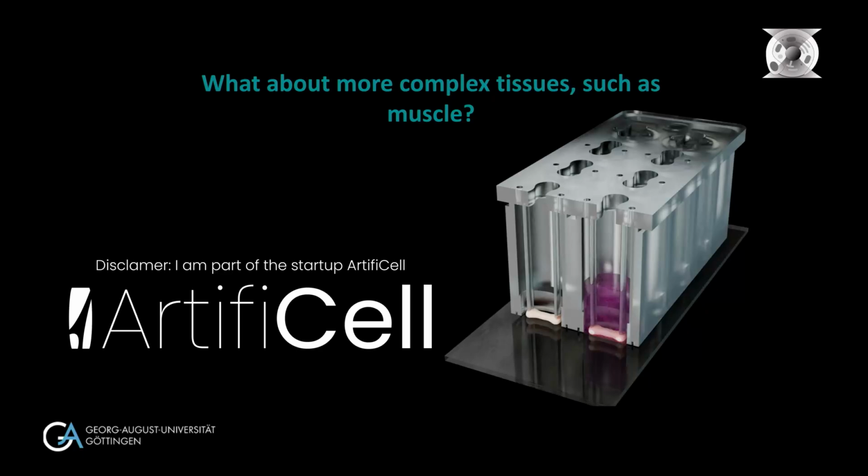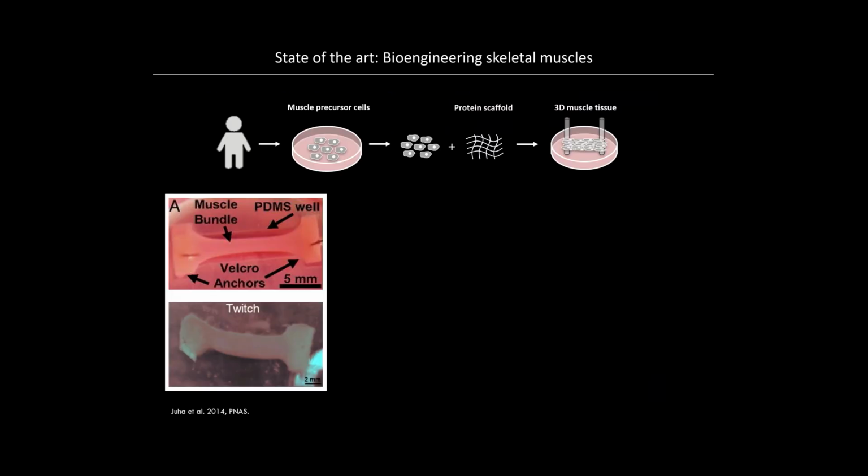But the main idea of this is actually not to become rich, but to provide these kind of chambers to the field, because I couldn't ask my workshop to produce them all the time for all the people in the world. But it's a nice thing, and I will show you in a second how it works. So the idea, well, I will first show the problem, or what has been done so far. The idea is rather simple.